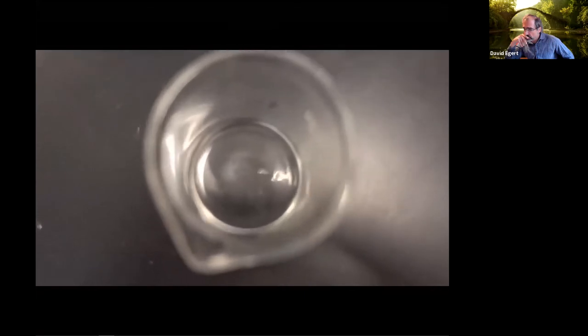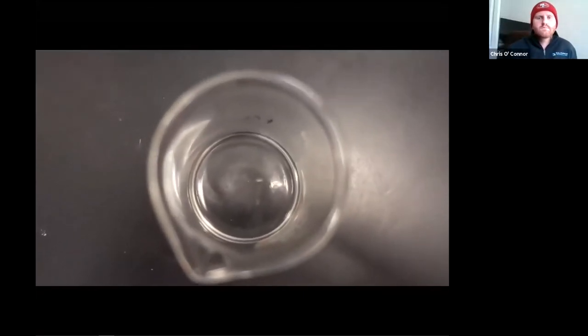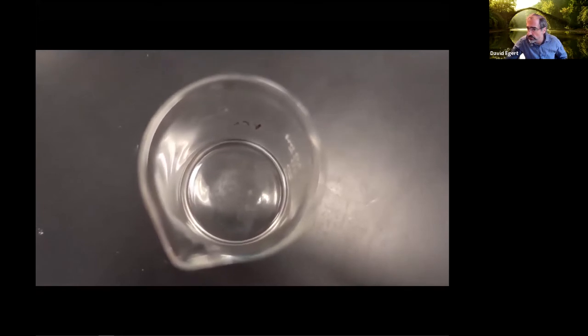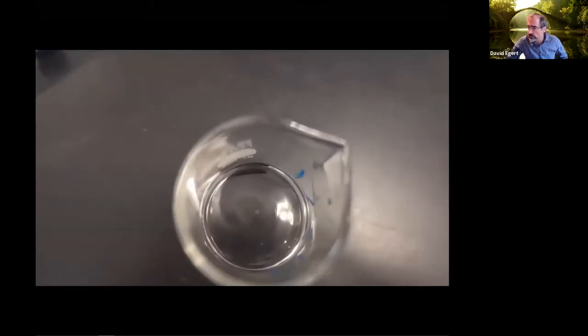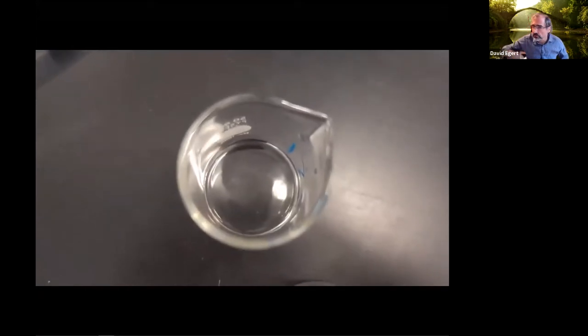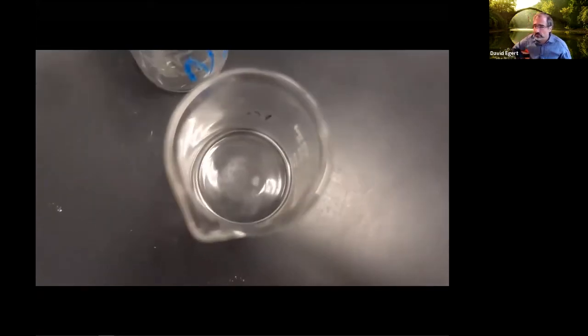And you can take a look, especially if you still have your other beakers. Like I have a beaker of sodium chloride here. They both look pretty much the same. What does dissolve mean? The crystals have gone into solution. But then we're going to look at another thing.